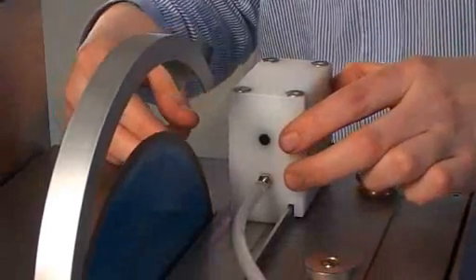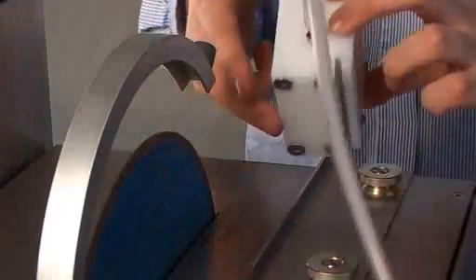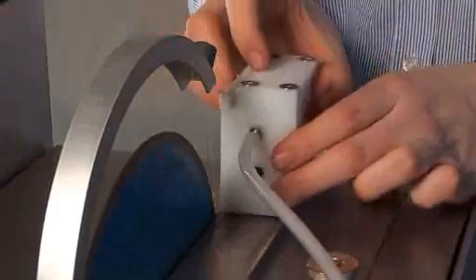When cutting the block, it's attached to one side of the vacuum holder. When cutting the final thin section, the other side of the vacuum holder is used. This means that you don't have to change the settings between each cutting.